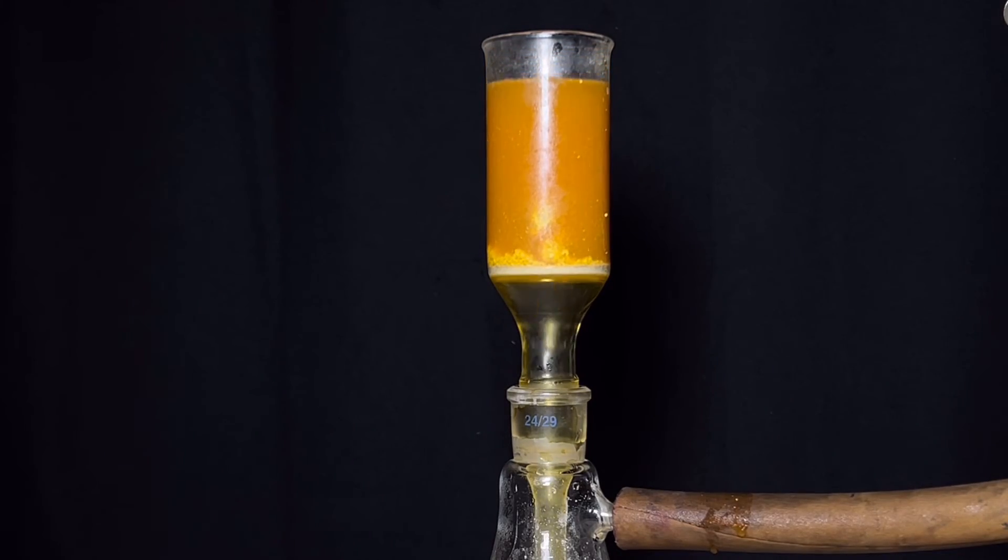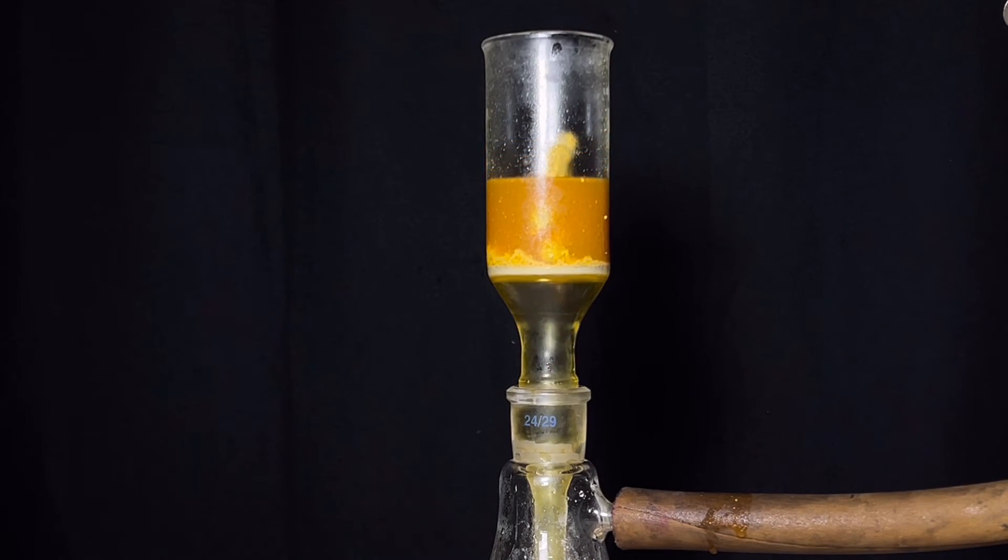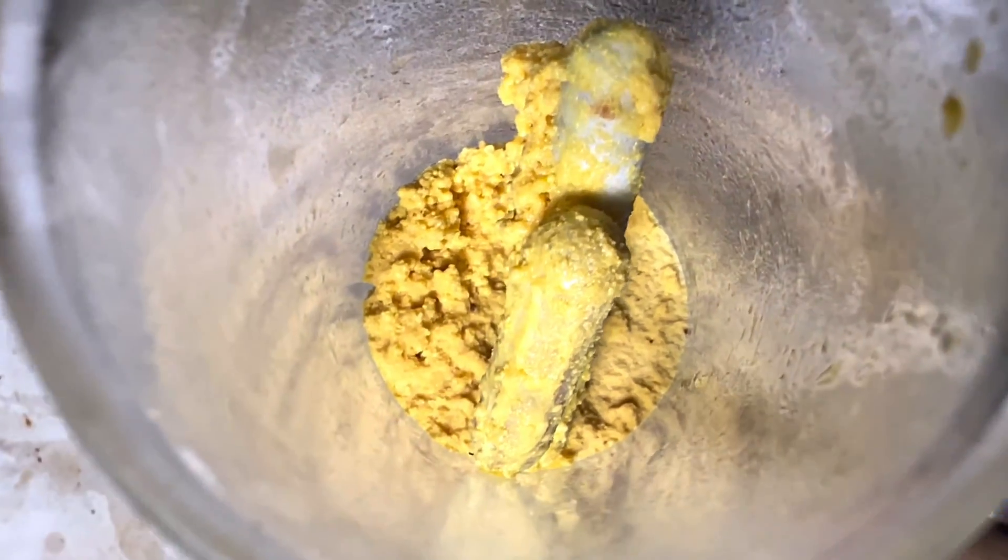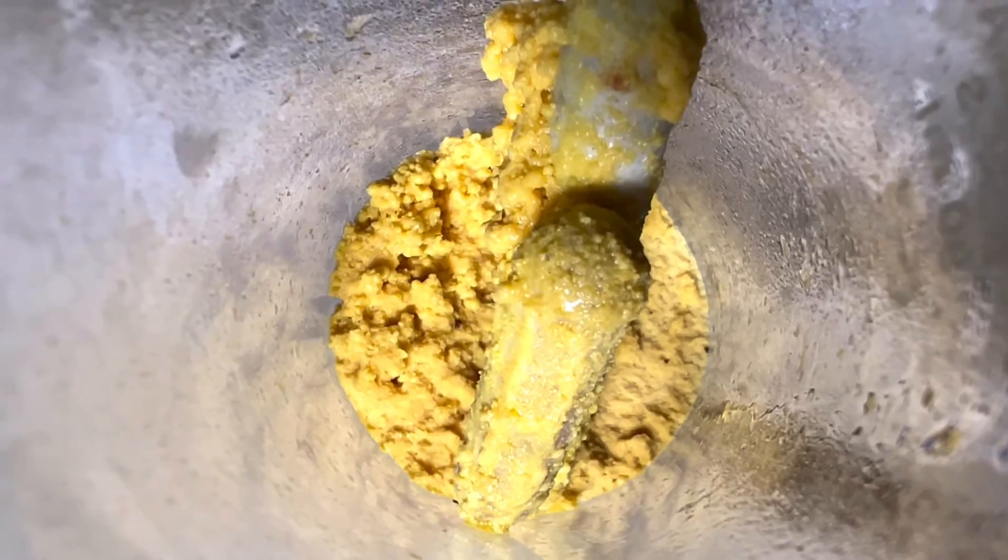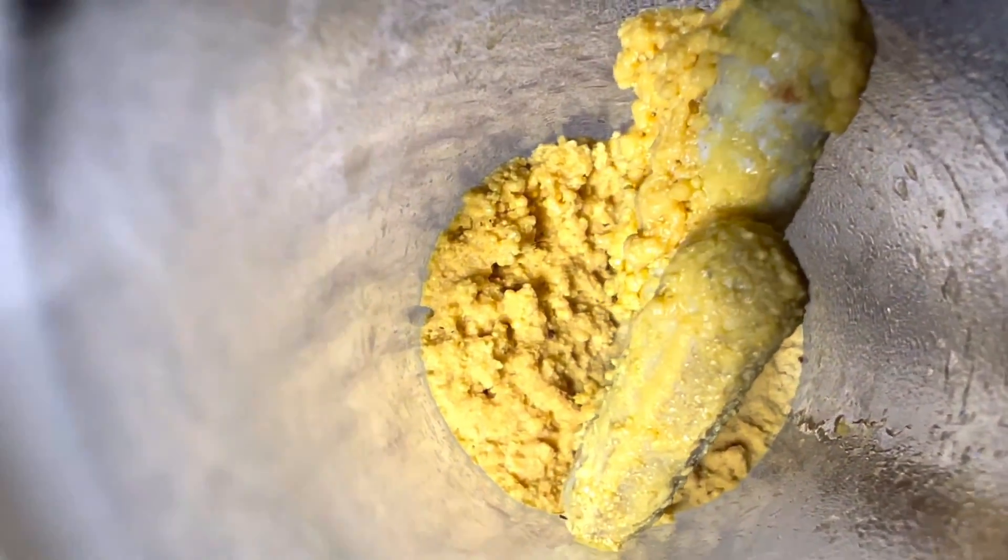This was then collected by vacuum filtration using a Buchner funnel. This is the crude product after filtration - it appears yellow. You can see two stirring bars which accidentally fell into the funnel.